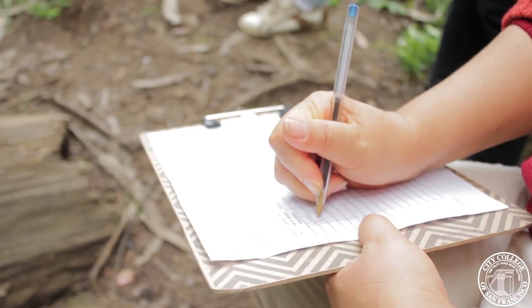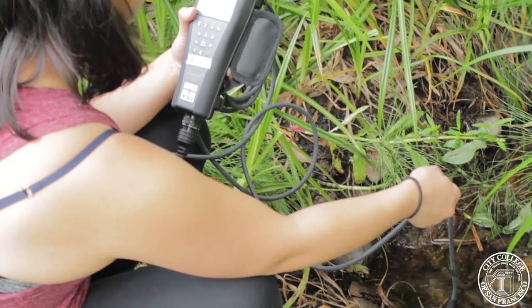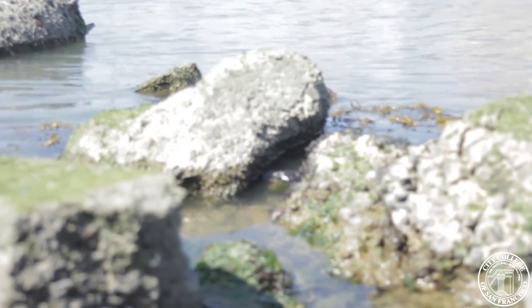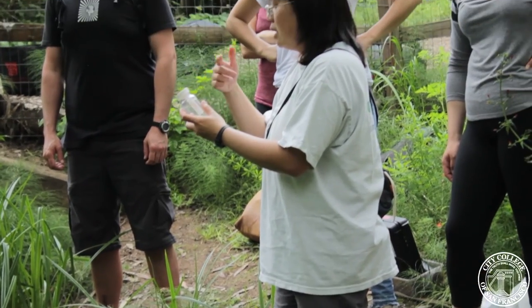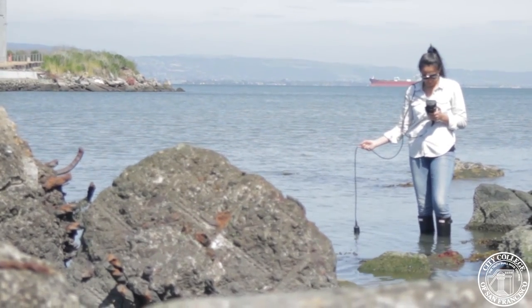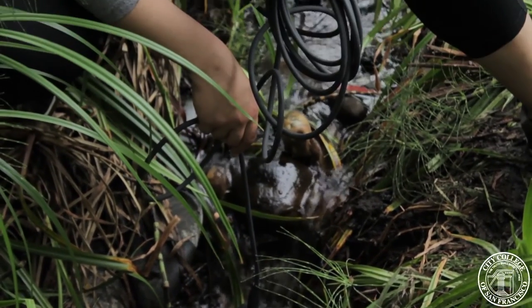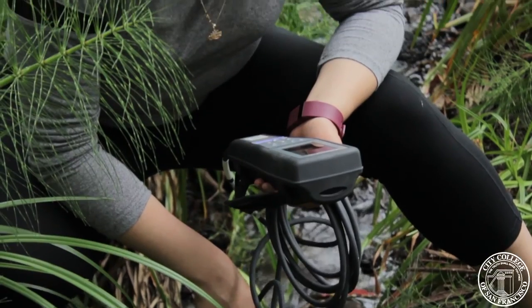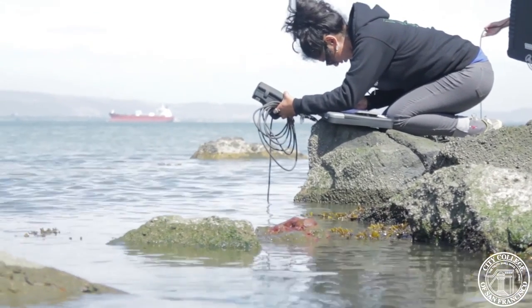Some of the water, as I said before, we're going to be testing pH between the range of 6 to 8. And pH is important for aquatic and biotic organisms that live in the ocean that we're testing, or fresh water. And it tests for ion concentration as well. So, if there are more metals inside the water body, it would show up on the meter as being a high acid range which would be toxic to some form of life.